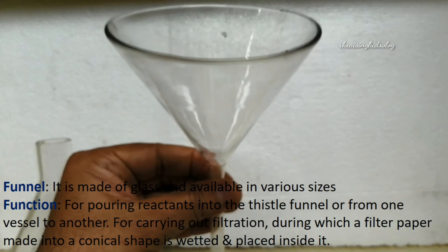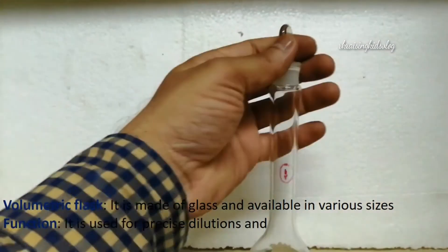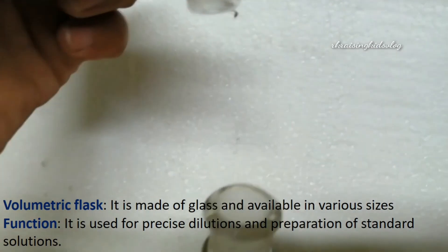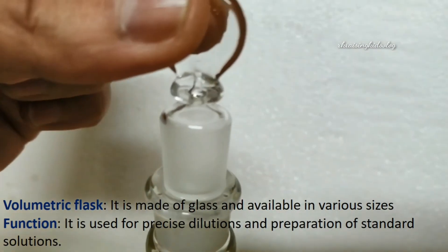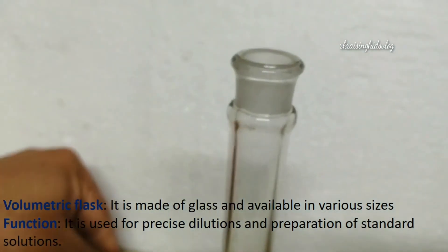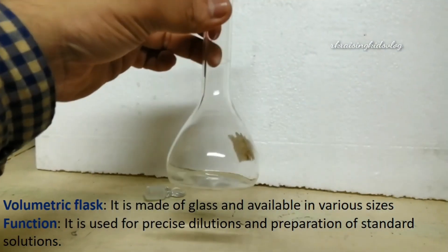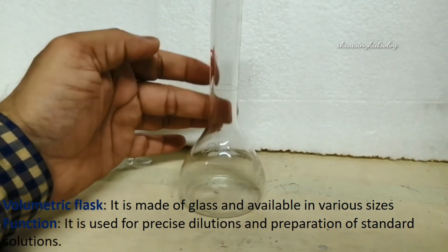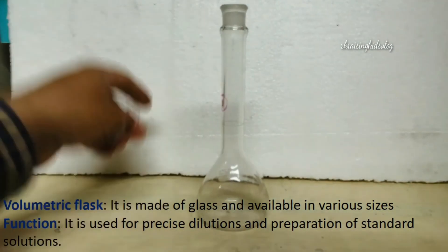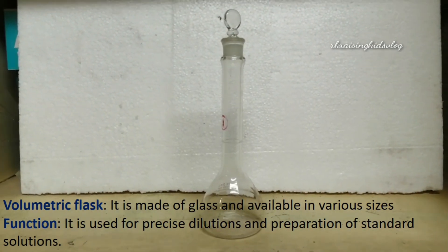By pouring liquids into the funnel which has the filter paper, the filter paper catches the dust and particles, and the liquid gets filtered and goes into a beaker or conical flask. Next, the volumetric flask — it is made of glass and available in various sizes. It is used for the precise dilutions and preparations of solutions. It has a cap used for closing the flask while mixing. It indicates the exact volume marking such as 25 milliliters, 10 milliliters, or 50 milliliters.